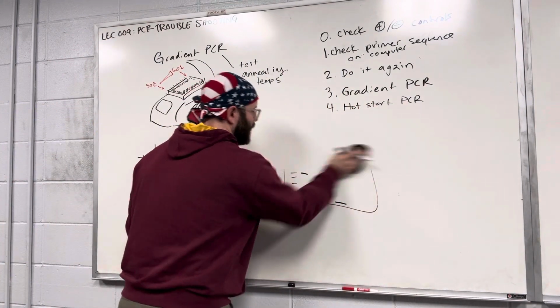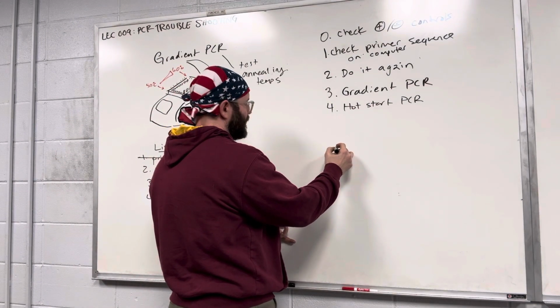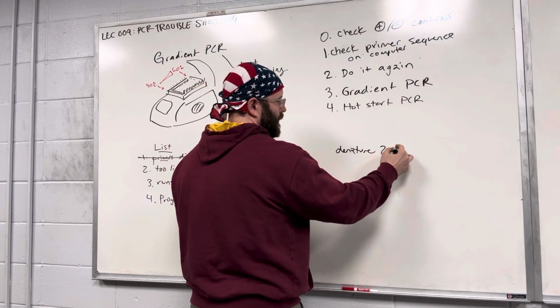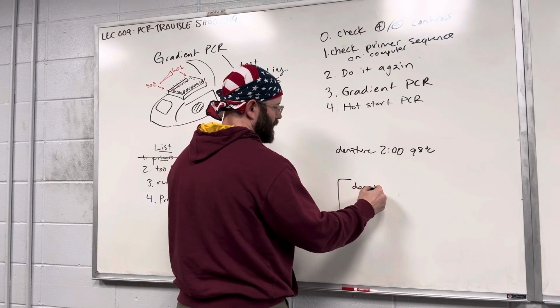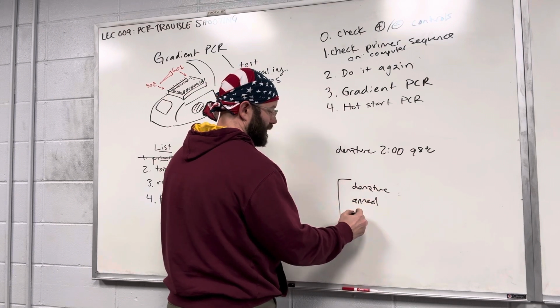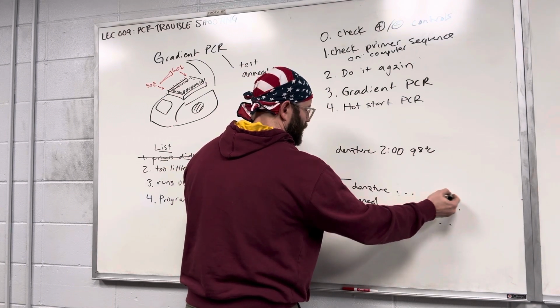So the fix is the hot start PCR. So in the hot start PCR, let's do our program again. We have initial denature, 2 minutes, 98 degrees Celsius, and then we have our loop. We have our denature, anneal, extension for various values and various times. Okay.